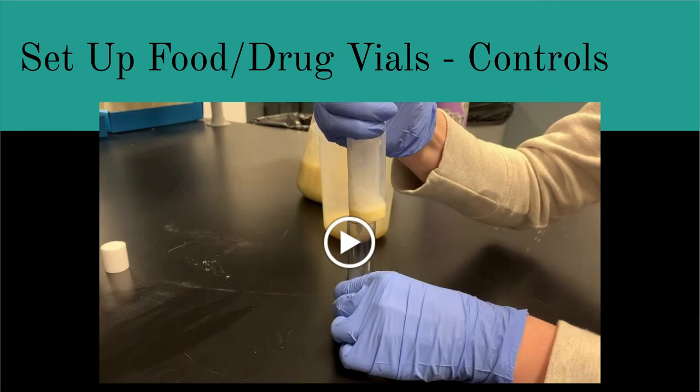So you'll need to set up your food and drug vials. That experiment this week is really up to you. I think almost everybody at this point has done what we call the high dose experiment, where we look at the effect of your compound at the highest achievable dose in someone's serum. You also did a dose response at a 1 to 2 dilution series to see whether your compound's effect drifts off as the concentration gets lower.